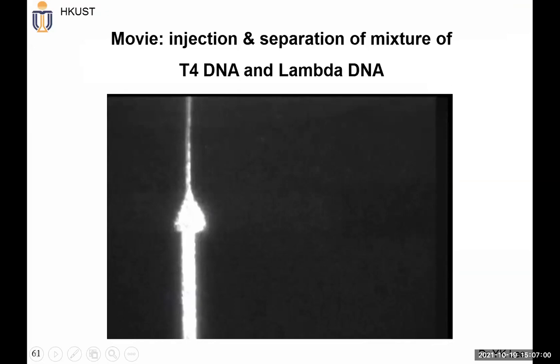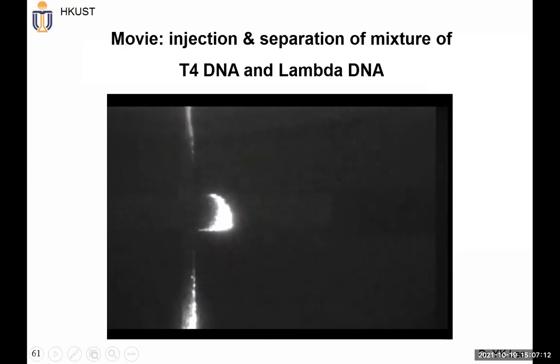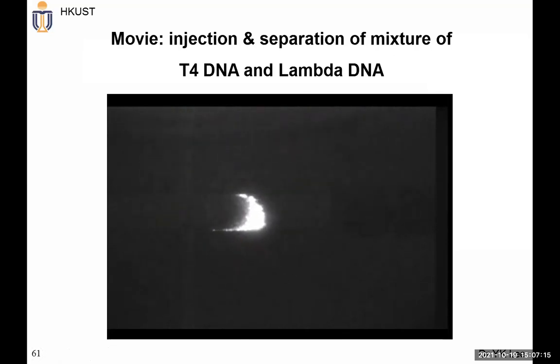Of course, let me show you this video again. So basically, vertically, we apply voltage for electro-osmotic pumping, and then to do a separation of mixed DNA in this kind of microfluidic array.